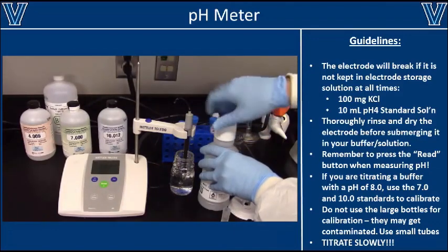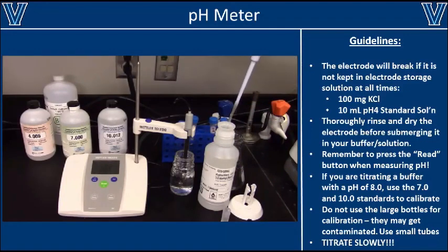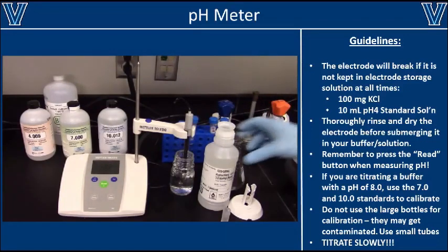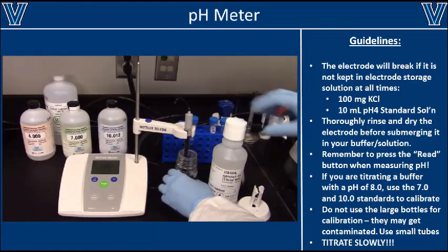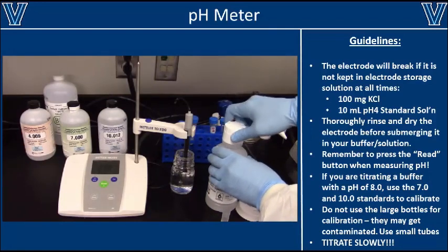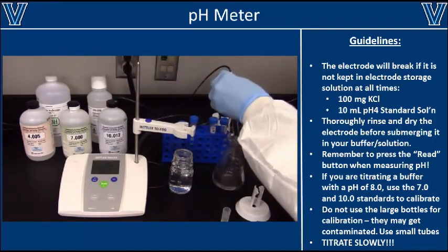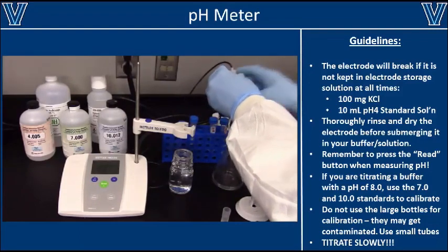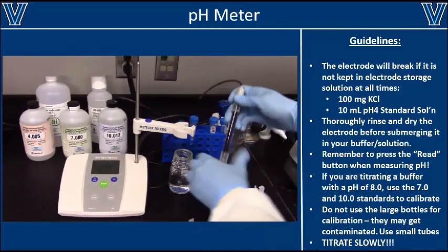Once the reading has stabilized, you can adjust the pH of the solution with hydrochloric acid or sodium hydroxide. Note that hydrochloric acid will decrease the pH while sodium hydroxide will raise the pH. In either case, add the acid or base in small amounts and vigorously mix the solution after you add them. It is important that you add the acid and base in very small amounts such that you don't overshoot and have to add excess acid and base. This will prevent you from adding too much salt to your solution. Once you are done titrating your solution, remember to put the electrode back into the storage solution.